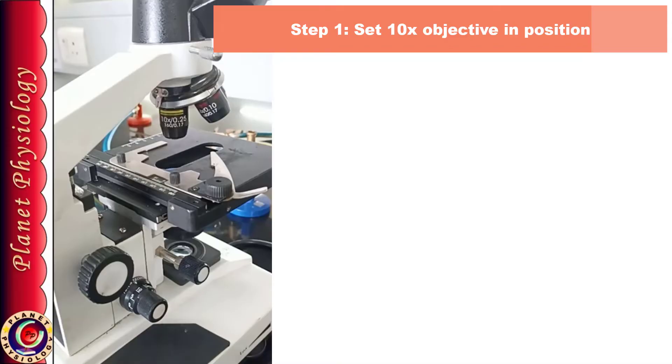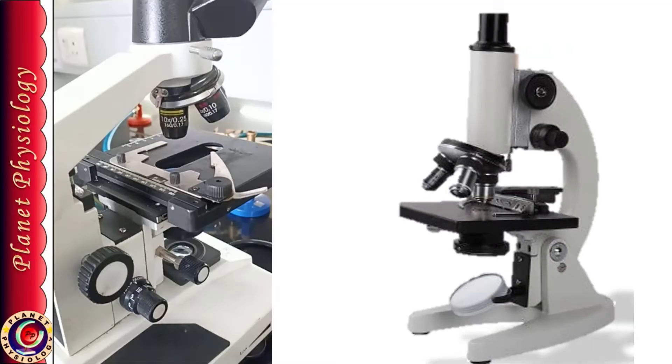If you are using self illuminated microscope, switch on the light and see through the eyepiece for proper amount of light. If you are using simple compound microscope, adjust the light with the help of mirror and make sure that light is sufficient.